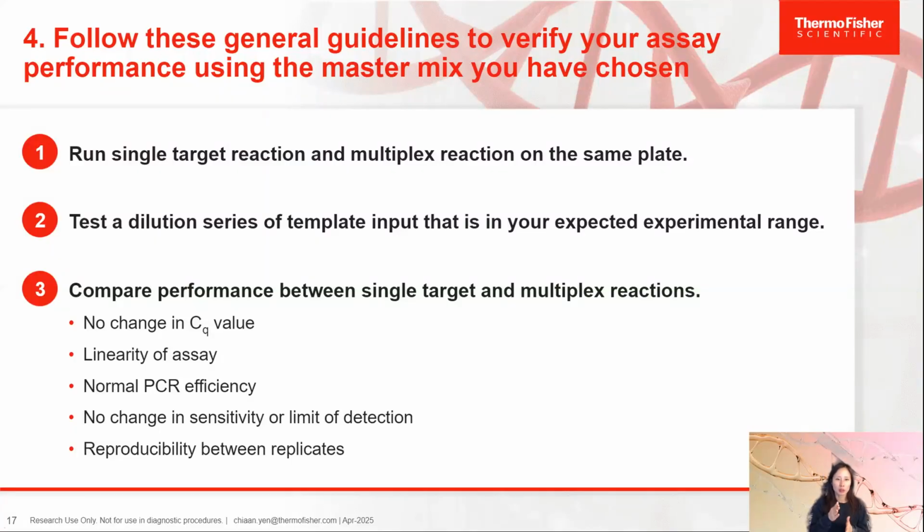So you definitely want to run the single target reactions for each of the targets and the multiplex reaction on the same plate, and ensure that the performance doesn't deviate once you scale up to multiplex, so that each target looks similar to how it would look in the single target reaction. Ideally, you want to test a dilution series of template input that is in your expected range.